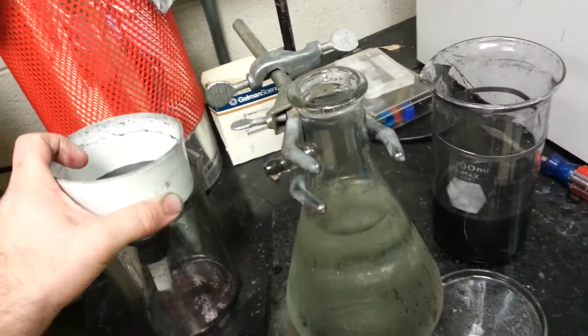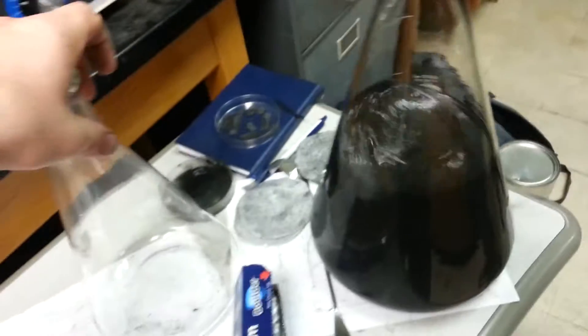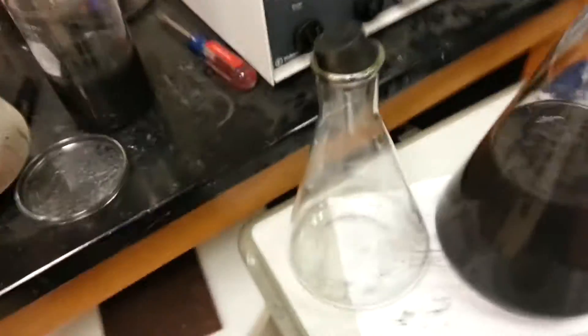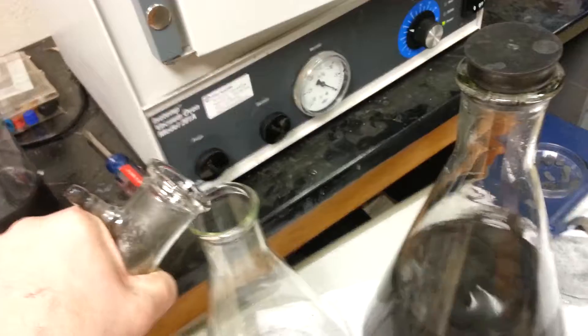It gets in the filter paper and cakes up a little bit. Then this solution goes in this jar. Everything gets so dirty because you have all this carbon.